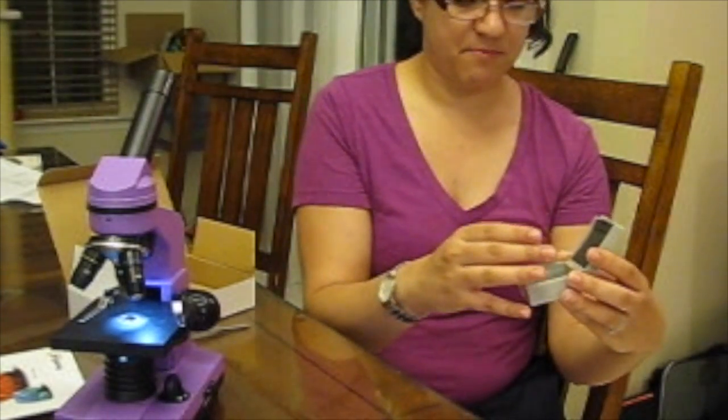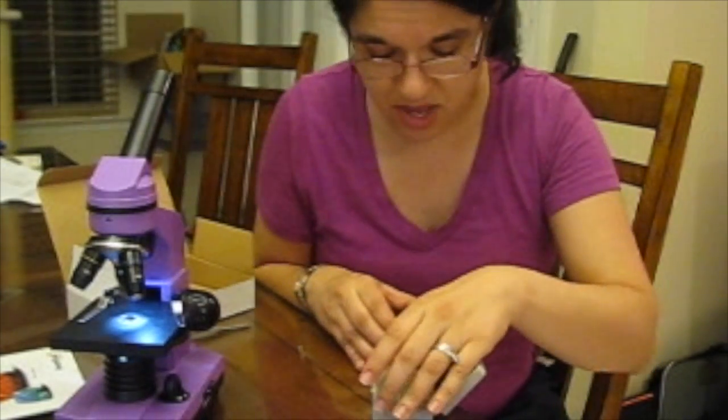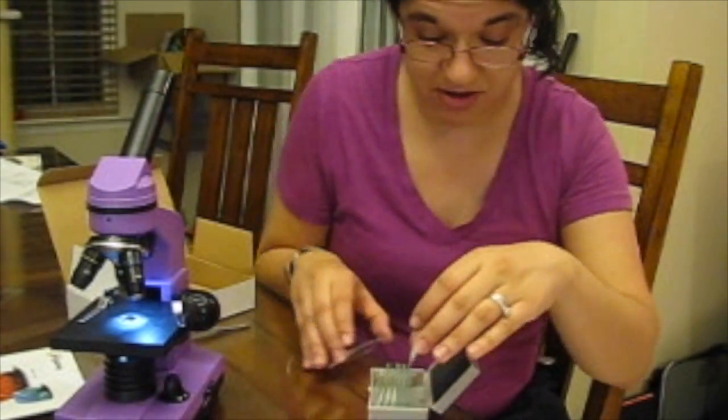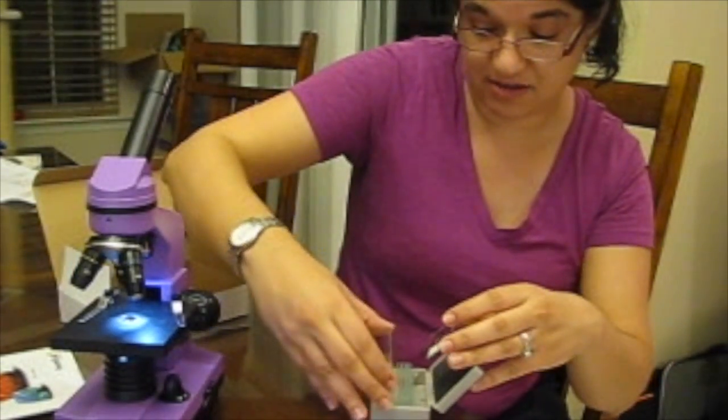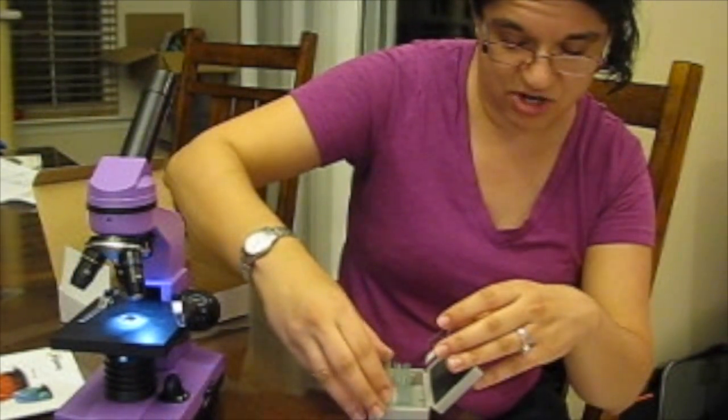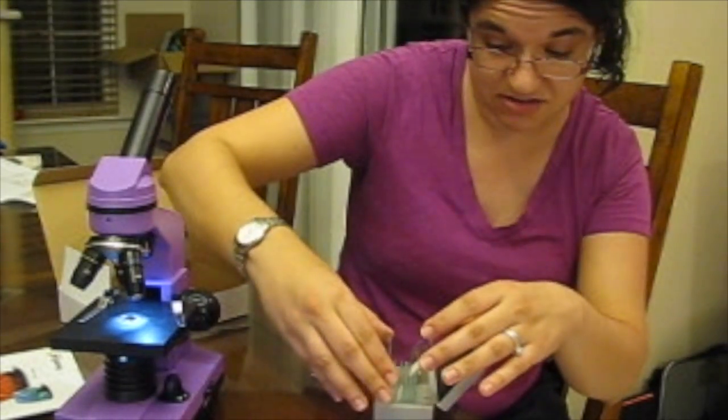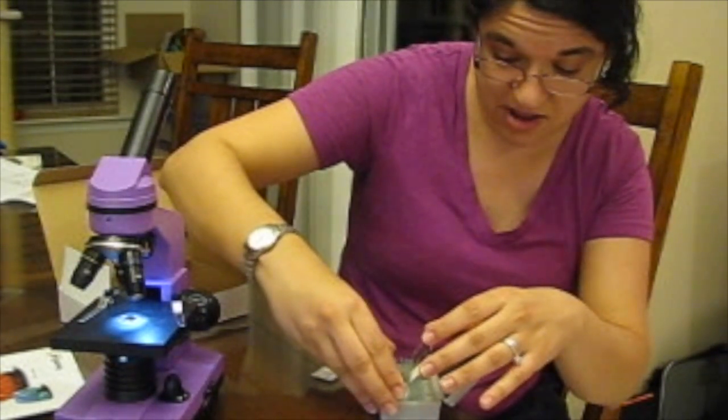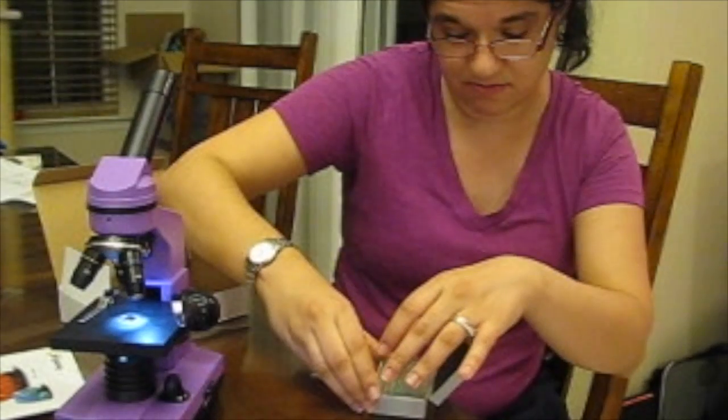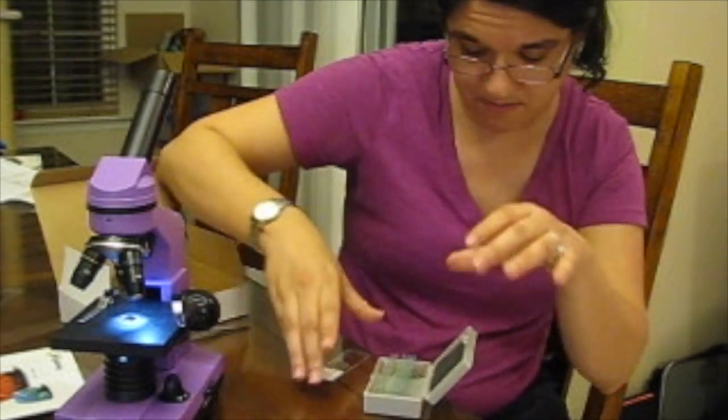And that booklet that I was showing even goes into detail about each of the samples, explaining exactly what you're seeing and some information about why it looks the way it does, which is great for inquisitive kids to help them learn. Just get these slides safely put back in the box.